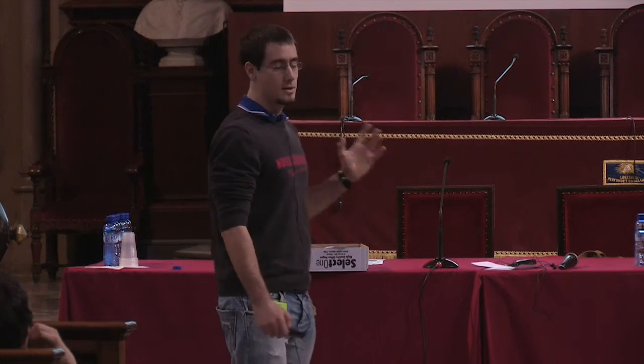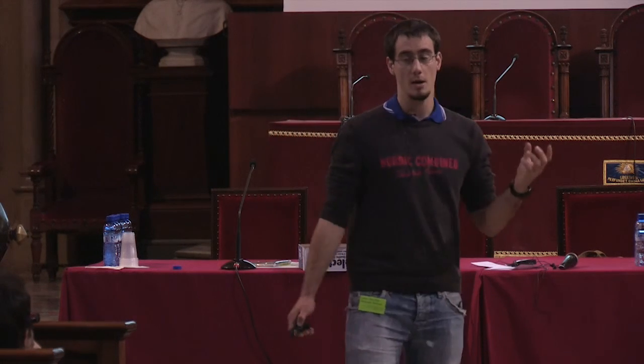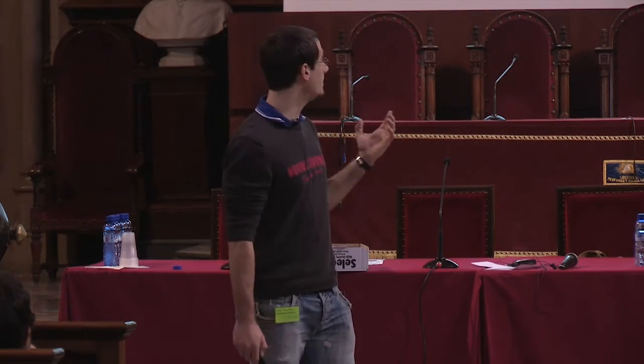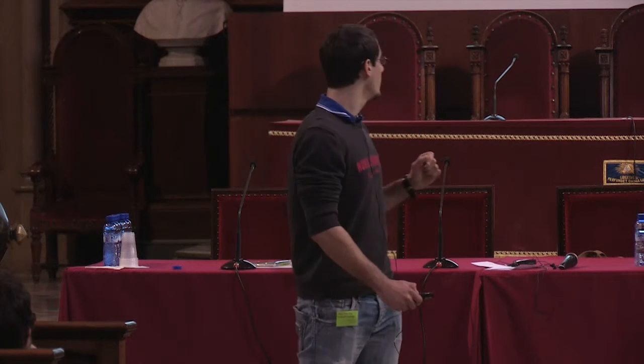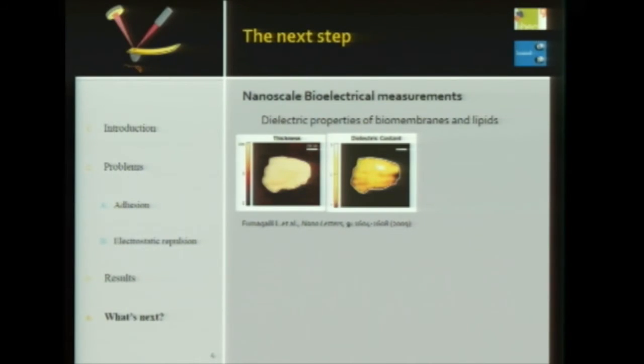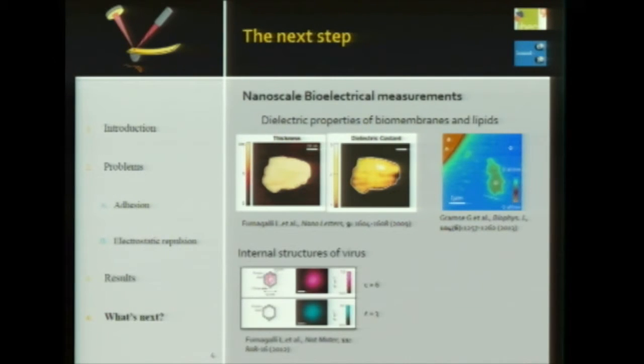So what's our next step? Our group, where I am at the Institute for Bioengineering of Catalonia, specializes in nanoscale bioelectrical characterization, where in our work we can actually calculate the dielectric properties of biomembranes and of lipids under liquid conditions. Also, another cool thing we can do is actually predict if a virus has DNA or not in its interior.